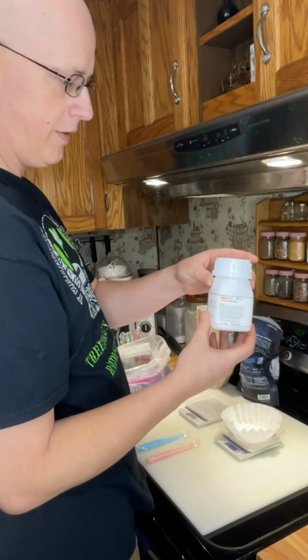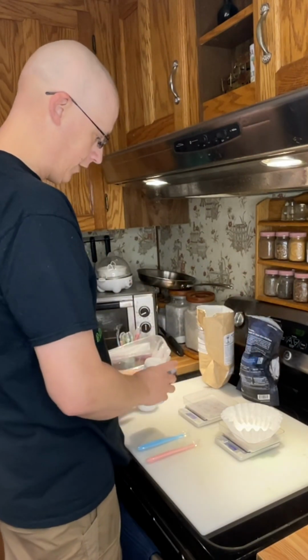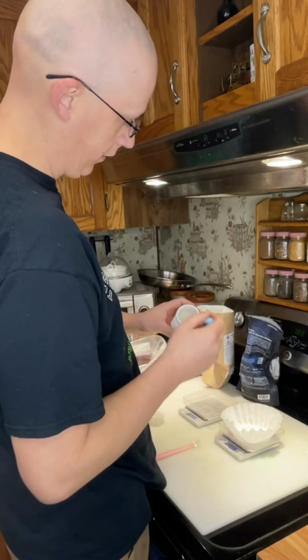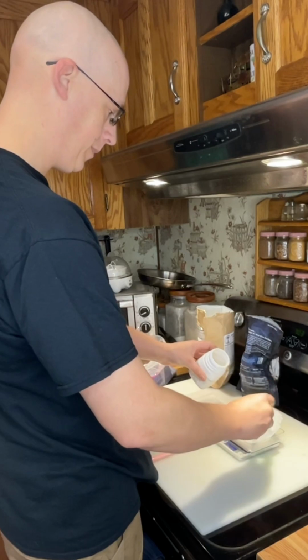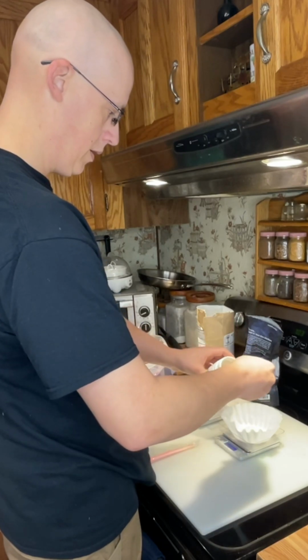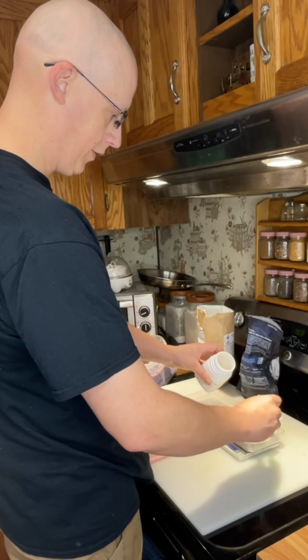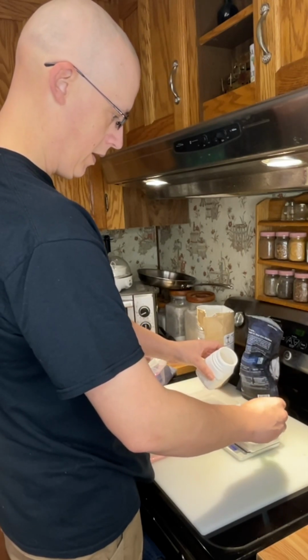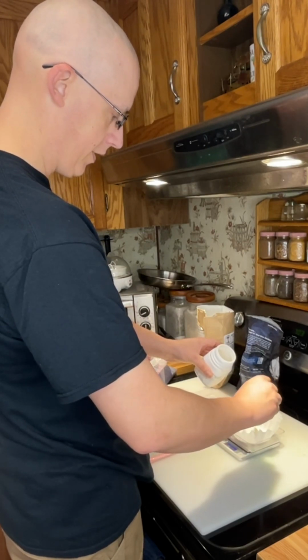Now we're going to take our fancy potato dextrose broth powder here from HiMedia. I use this stuff because it's easier to add, and it's very clear, nice clarity. In this case, I'm going for a clear Gellan gum. So we're going to add 8.5 grams here. And these are for 500 milliliter batches. So that was 12 grams of Gellan gum and 8.5 grams of the potato dextrose broth powder. It's kind of tough to say early in the morning.